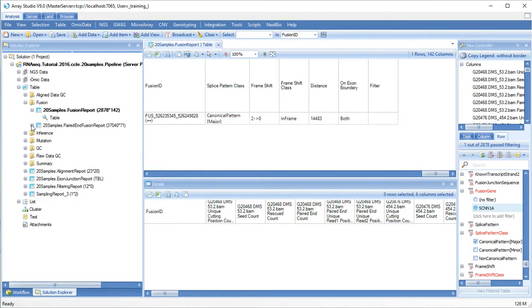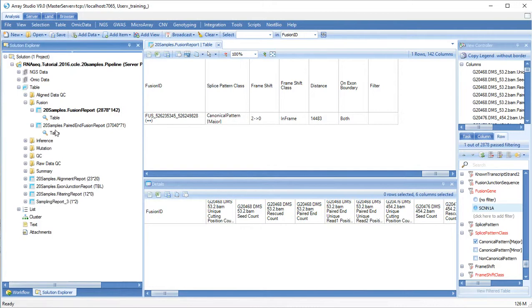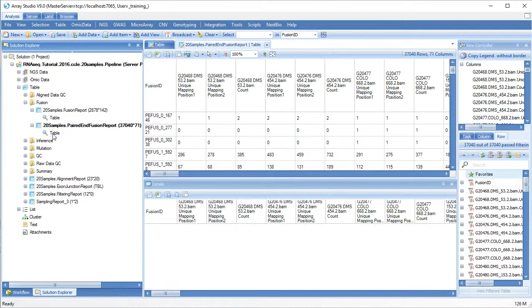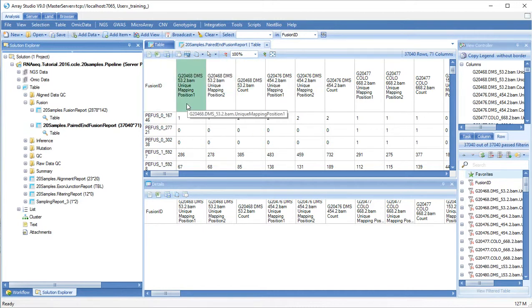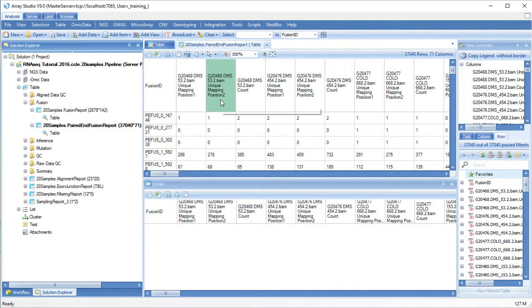The paired-end fusion report does not consider fusion reads, but is only looking for read pairs where each read was mapping to a different gene location. Again, for each sample you will get an indication of the unique mapping positions to each location and the total number of read pairs mapping to this fusion event.